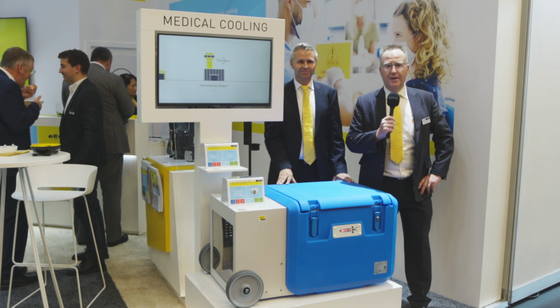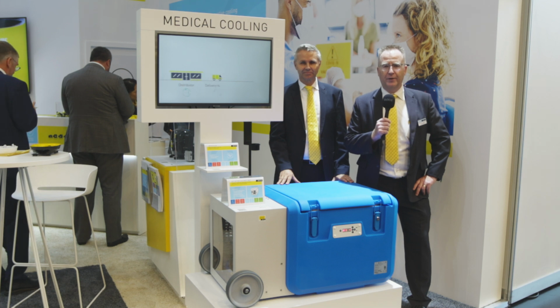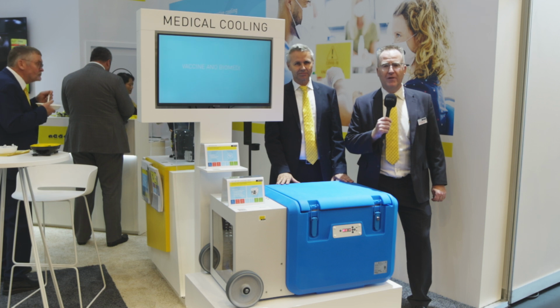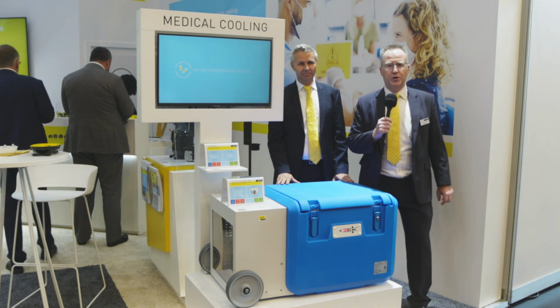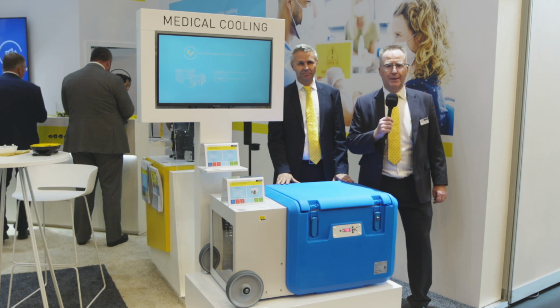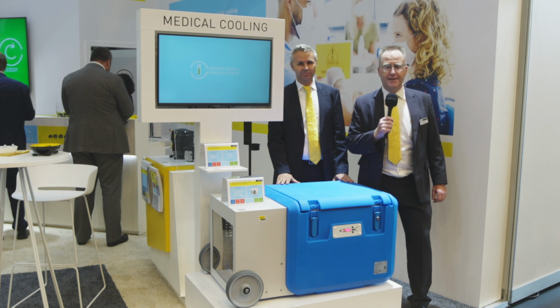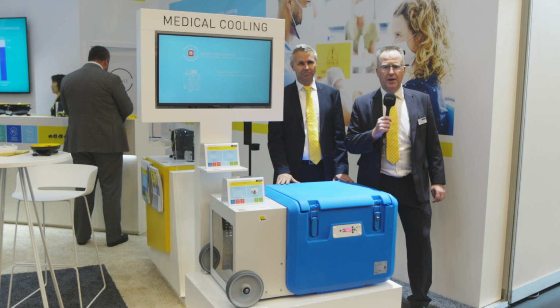Absolutely, I would love to. The main feature, or the technical challenge for this one, was that this box needs to be able to operate out in rural, very rural areas. And we talk about high temperatures, dust, everything, and then it needs to be able to maintain a very stable temperature around minus 86 degrees. So the whole challenge was actually to create a unit which was robust enough for extremely challenging environments. That's really the technical core of this one here.